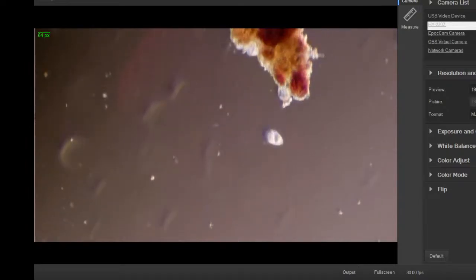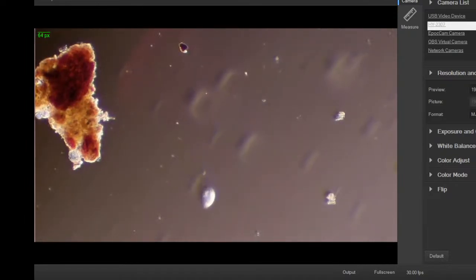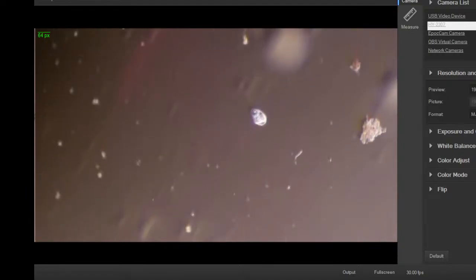Yes, it was me being Flemish, and I don't mean Belgian. Some nice colors, though. Some nice structures, like old leaf material from this. This is, if you didn't hear the beginning, rainwater collected in a driveway nearby with some kind of decomposing leaves and who knows what else. You have people walking through it, cars driving through it, dogs walking through it, leaving all kinds of goodies behind. And made a pretty good slide. This is still this first slide. It hasn't dried up yet. Been on for maybe an hour or something like that, 45 minutes.